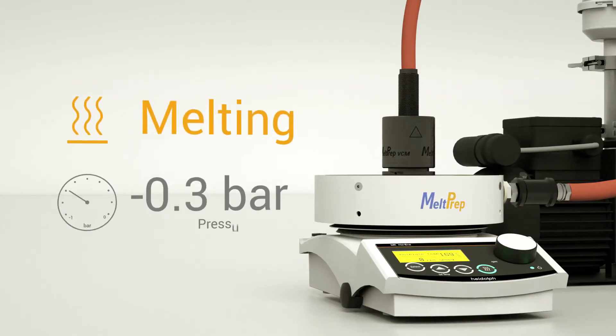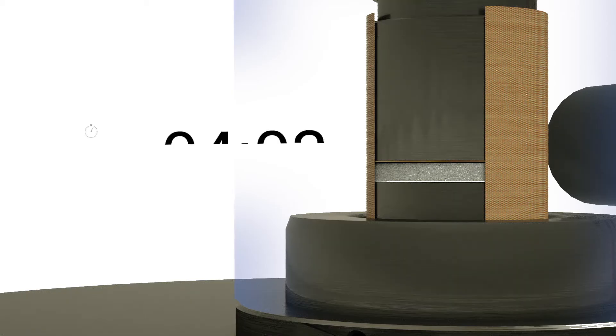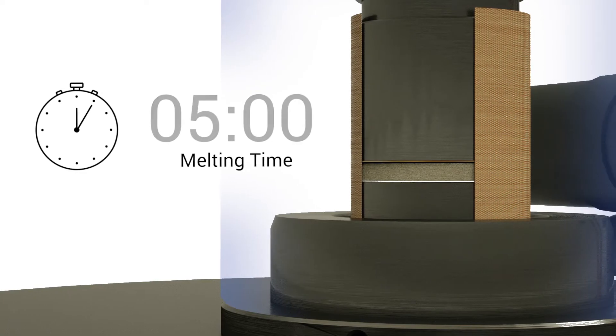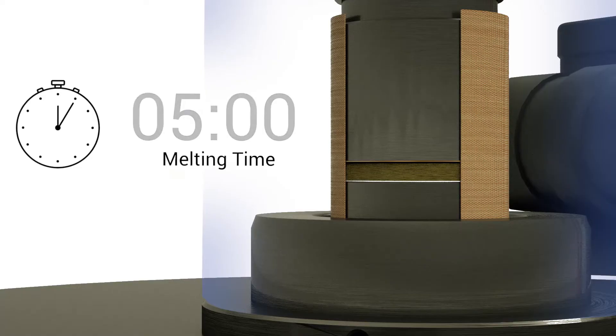Place the VCM tool on our innovative hot plane equipped with vacuum clamping to begin the melting process. The compact design of the VCM tool drastically reduces the melting time. Additionally, a vacuum is applied to prevent bubbles in the sample.